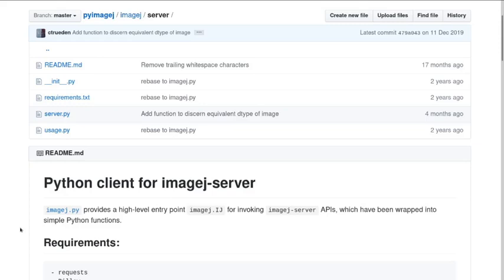However, I would like to point out it's very flaky at the moment. This was not the bit that broke, but I did cause this to break several times.